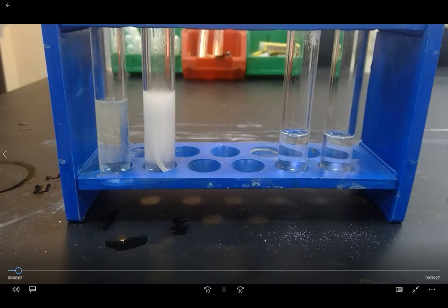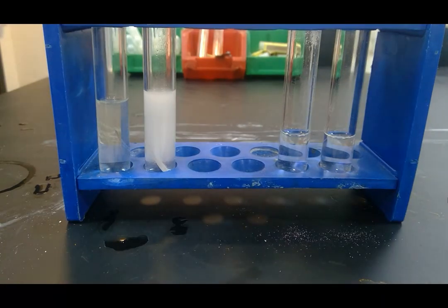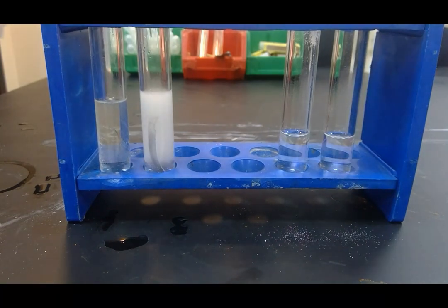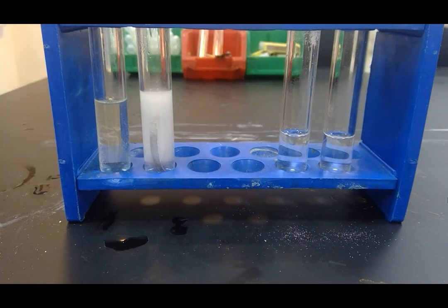Okay, the reaction of the magnesium with the hydrochloric acid is now finished. So you can see that there is no more magnesium in the tube which contained the hydrochloric acid, whereas the one in the ethanoic acid still has quite a large piece of magnesium there. So this shows that our hydrochloric acid was the stronger acid, and it has therefore reacted with the magnesium more quickly.